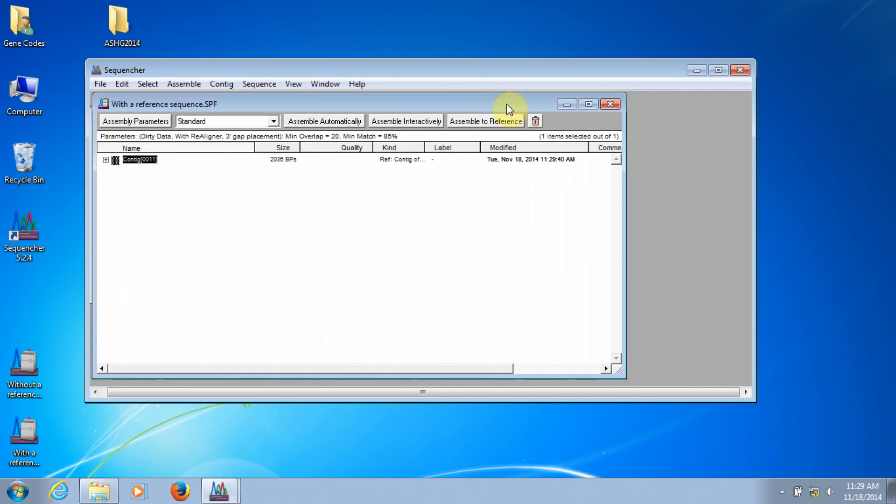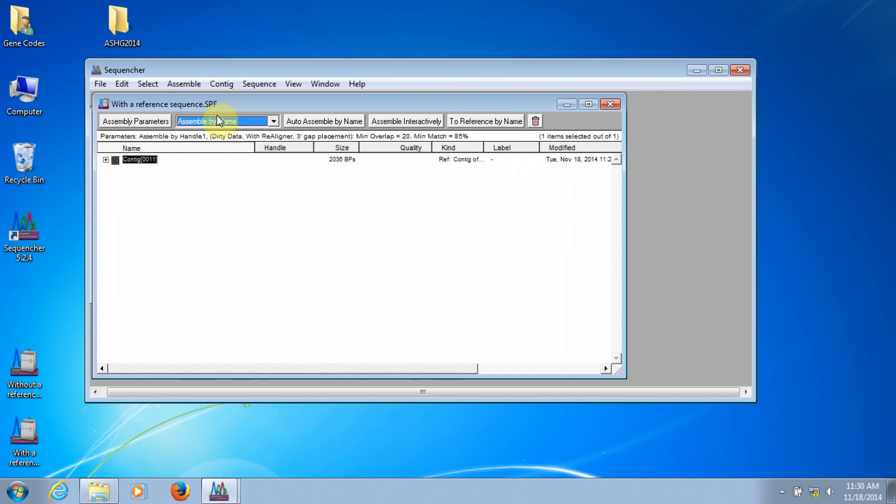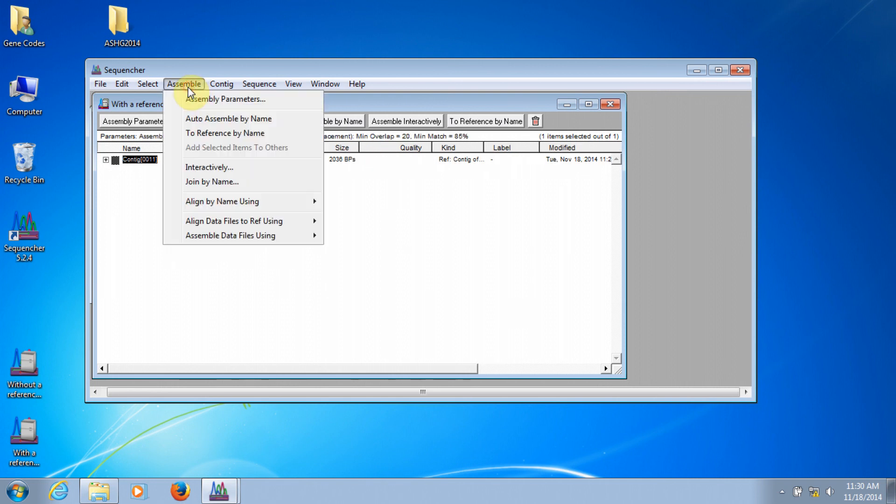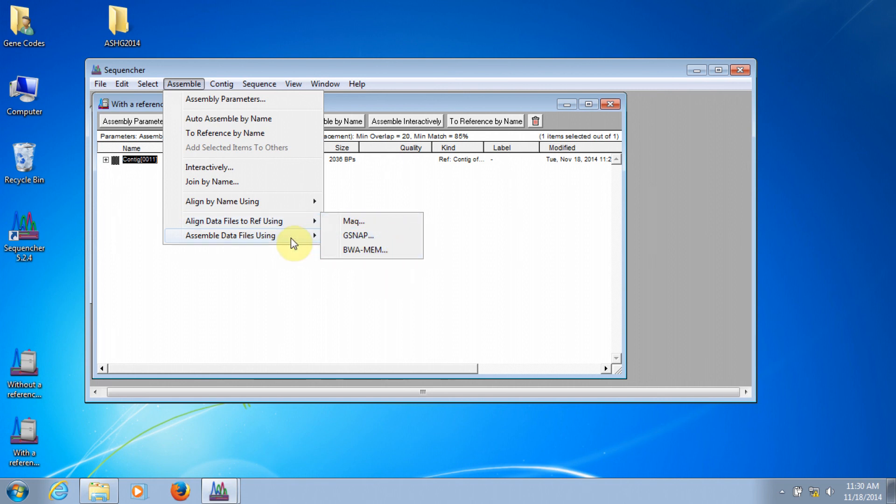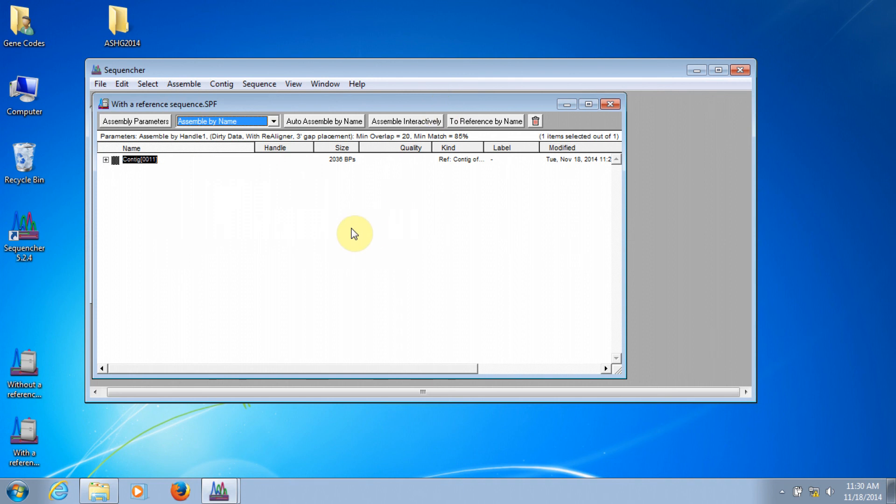Sequencher also has the ability to assemble by name, and if you have NGS data, you can use a number of different algorithms for either aligning to a reference sequence or de novo assembly. We'll look at each of these in future installments of this series. This preview of assembling contigs in Sequencher has been the third installment in the Sequencher tour guide series.